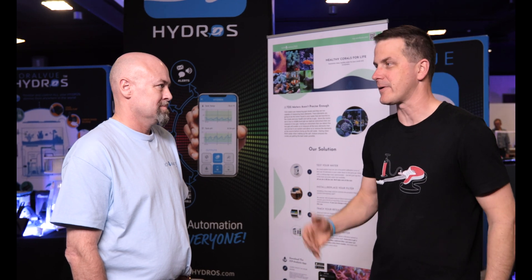When we test our saltwater tanks we want to know exactly what's in our tank — that's why we're testing. Over-the-counter test kits work all right. ICP got us more and more accurate, but now icpanalysis.com has mass spec ICP, which is said to be way better. Tell me why, Steve.